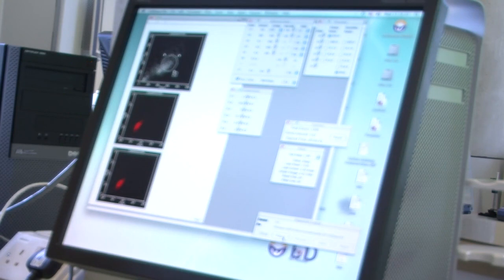It does happen sometimes. I've done experiments where I've had to. You start with low numbers and you lose a lot, and you click on acquire, and you sit there for literally 25 minutes waiting for a tube to run down, and you just about get maybe 2,000 cells. We've not had that. All of our cells have gone through at a decent rate. You've not lost huge numbers.